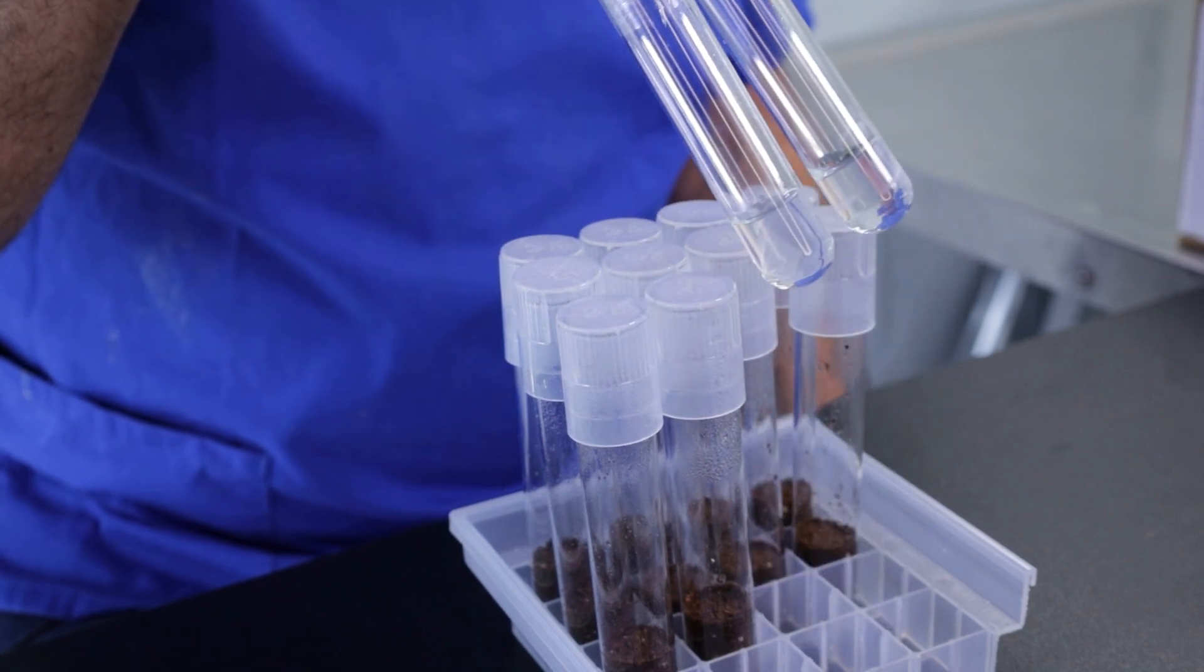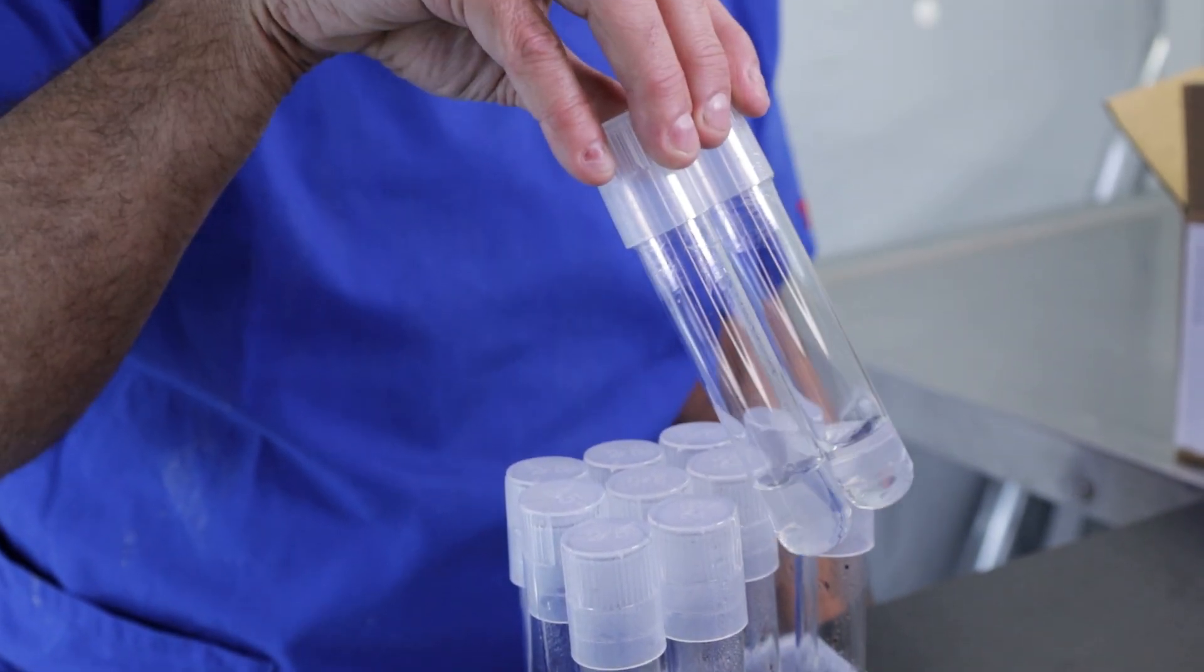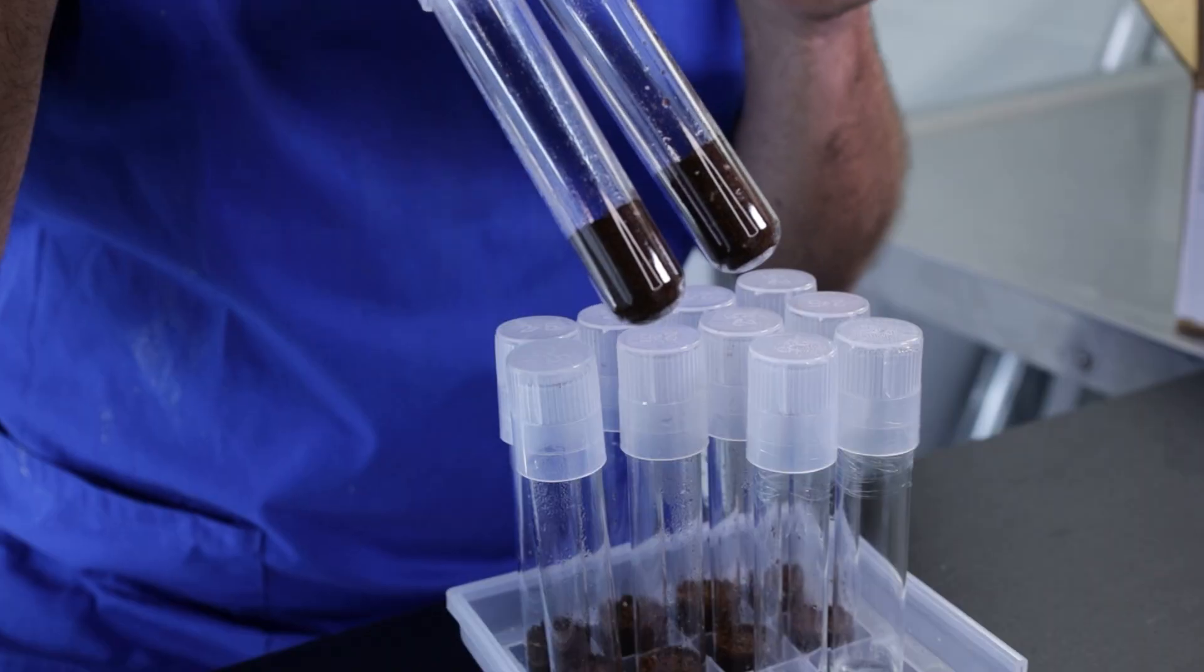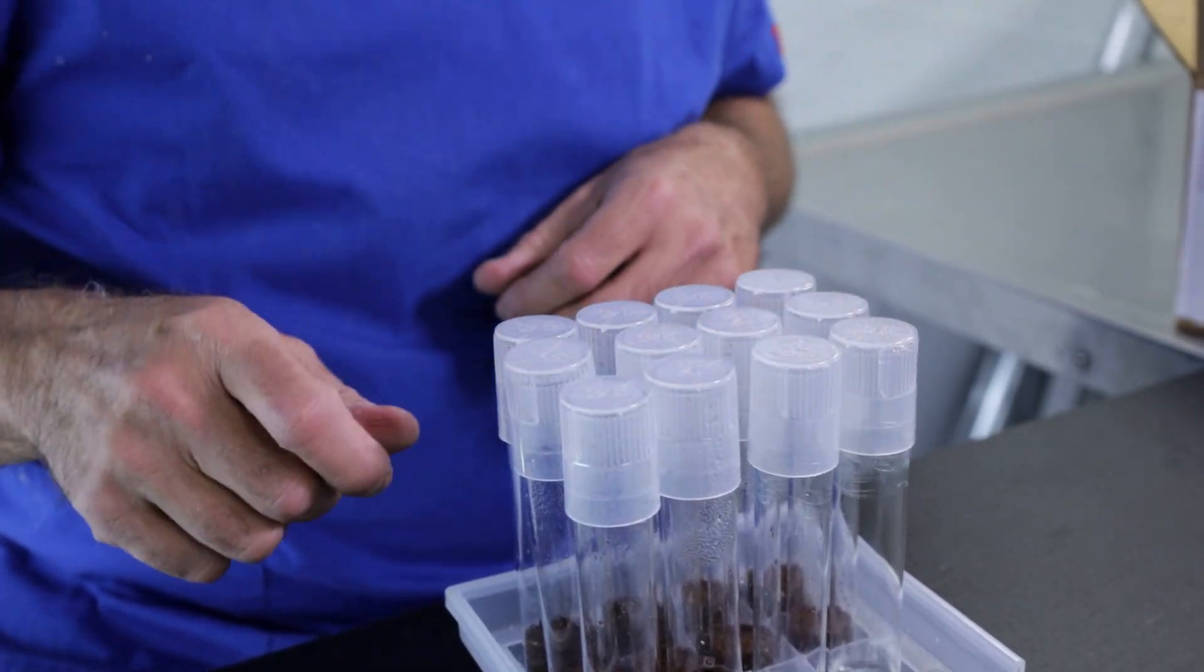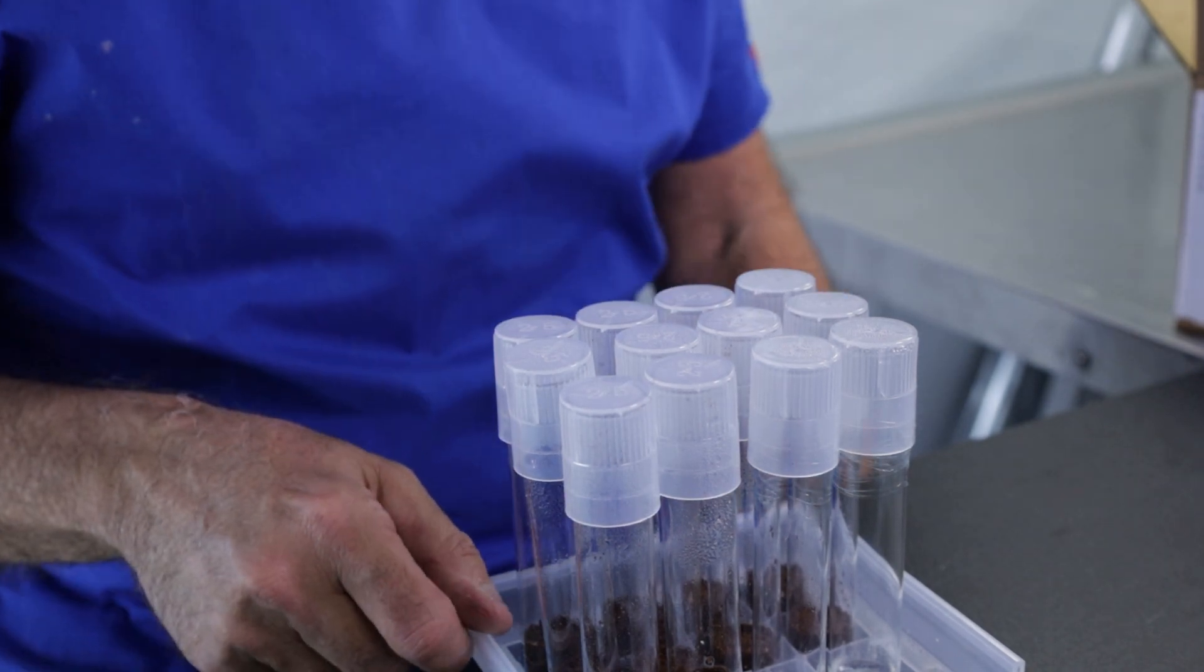Two tissue culture rescue tubes, so if you get a seed that you put in this medium and it only partially germinates, we can still move it over to the rescue medium and give it a chance to let tissue culture feed the last surviving tissue and possibly save your plant.